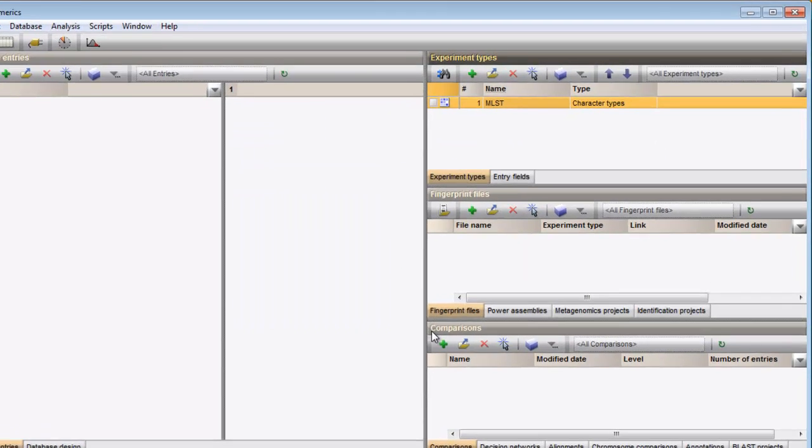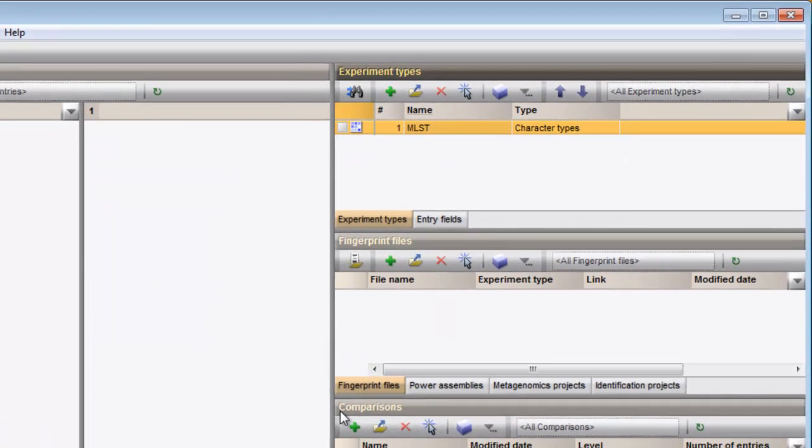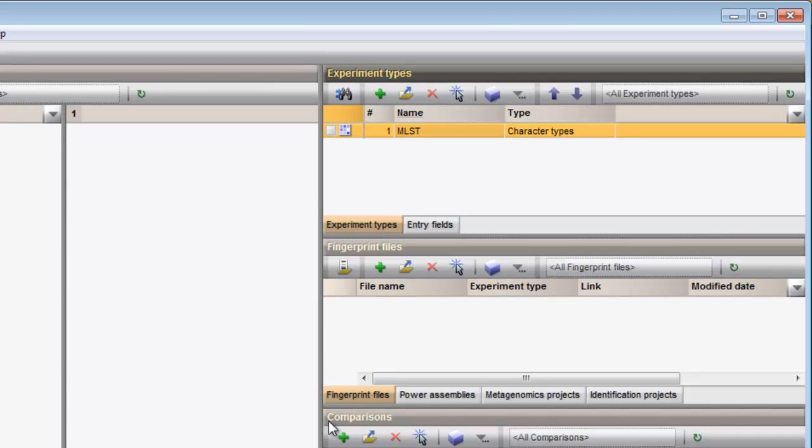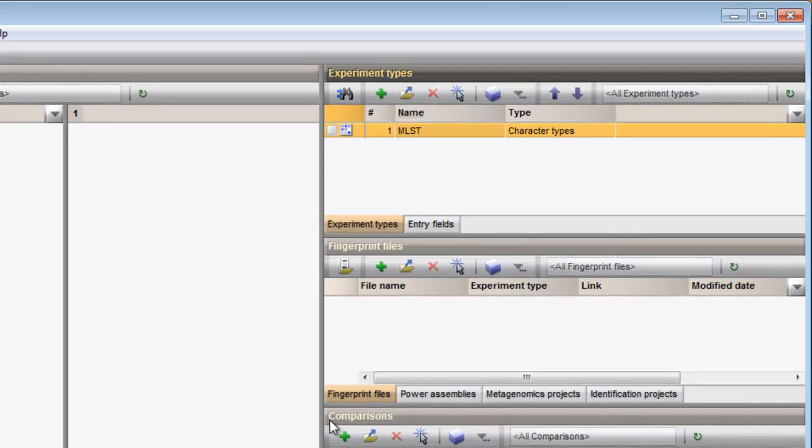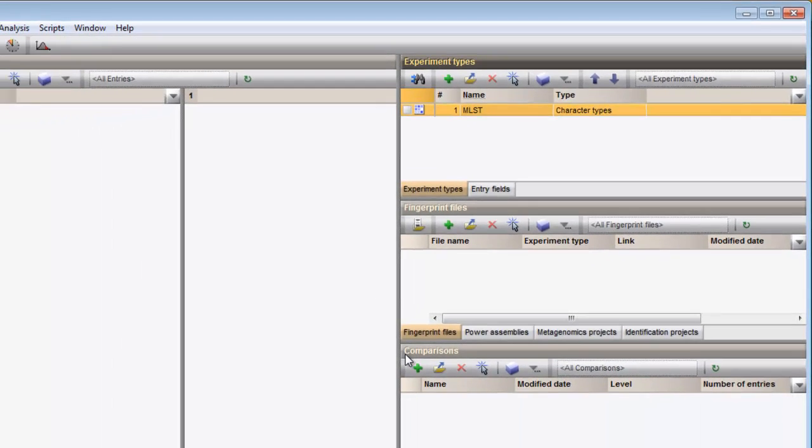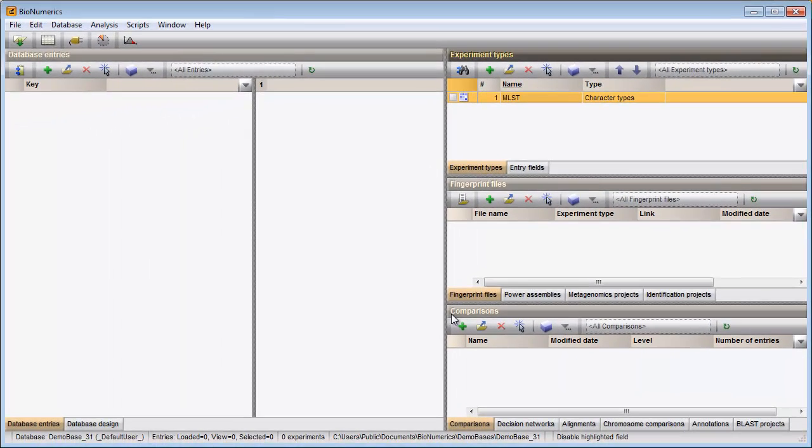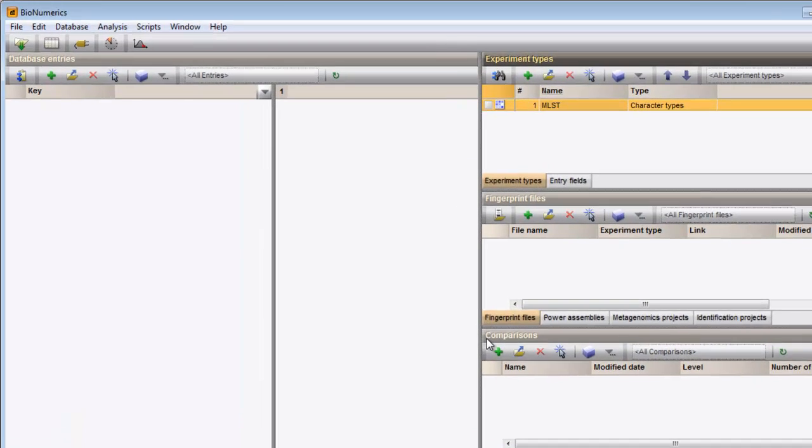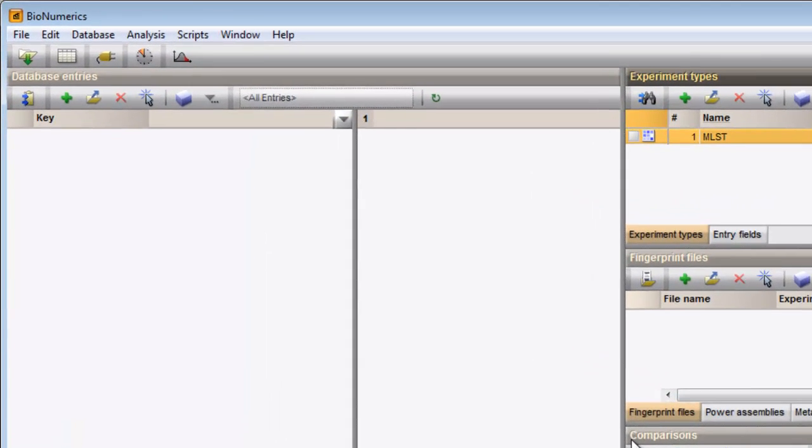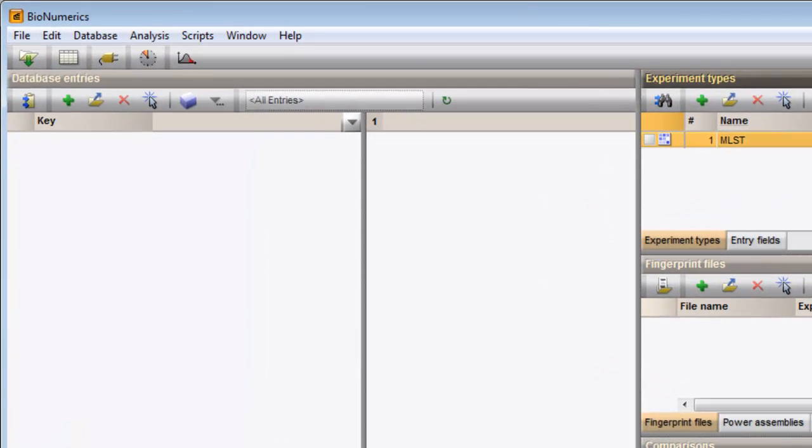The character experiment is created and is added to the Experiments panel. After import, my samples will be displayed in the Database Entries panel. This panel is located on the left-hand side in the main window.